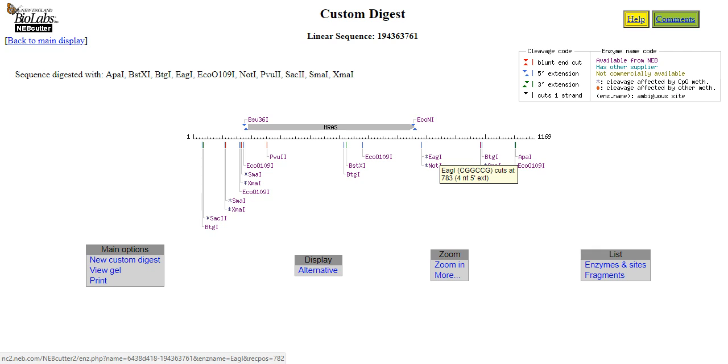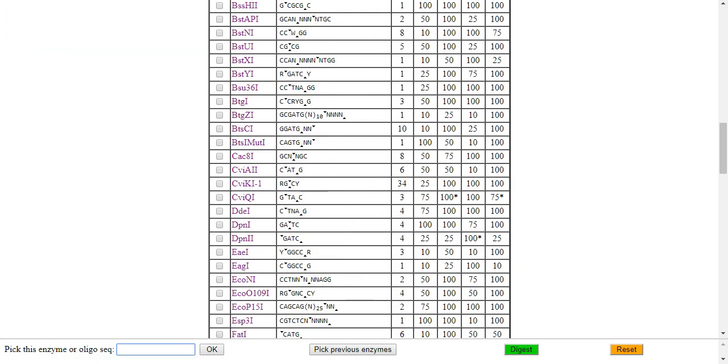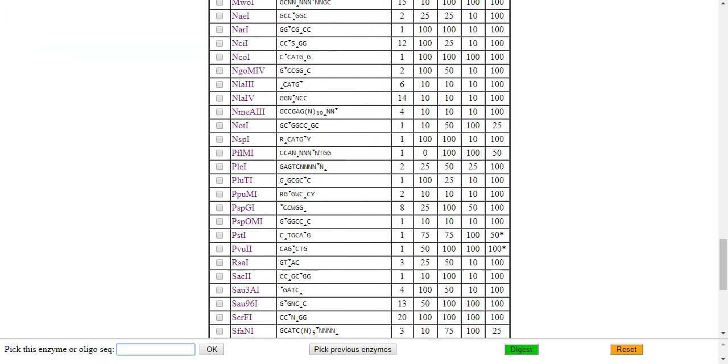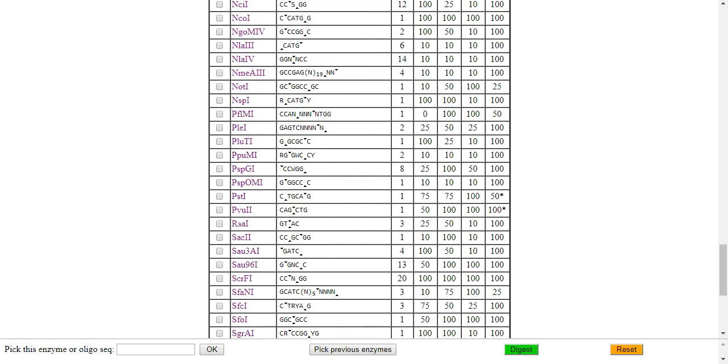Now, my teacher gave me a thing called a fingerprint enzyme called PvuII. And by my teacher, I mean myself. All right? So I'm joking. All right. So we're going to do a new custom digest. So we've picked our choices, and I'm going to follow these rules. Okay? Sma1 would have been a better choice. Sorry, Xma1 would be a better choice, but Sma1 would be fine. Like a base pair here or there wouldn't matter. Okay? So I'm going to do another custom digest.